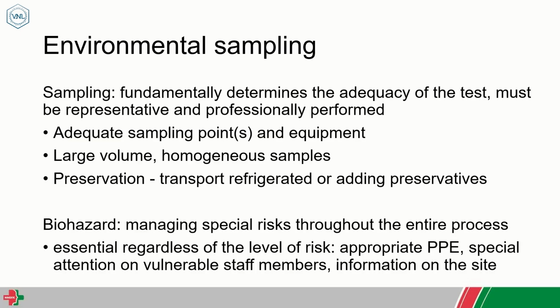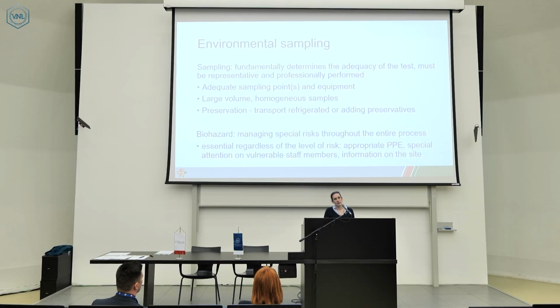And a few words about environmental sampling and sample preparation from the environmental research side. As for all samples, sampling is a very important step which determines the adequacy of the whole test. It is especially important in the case of environmental samples to adequately choose the sampling points and the equipment to have a representative sample.